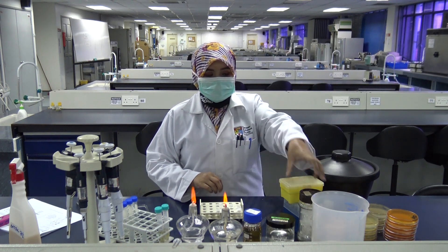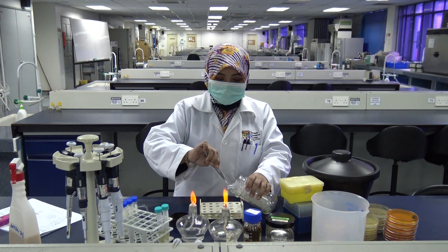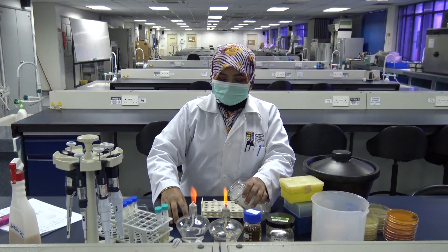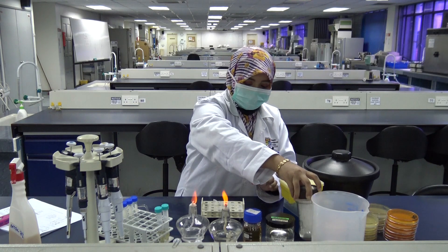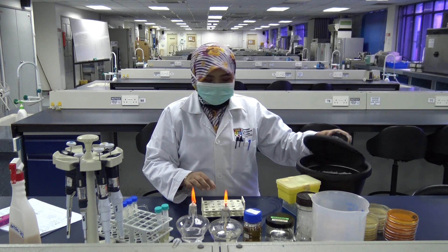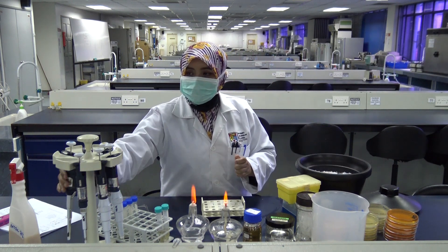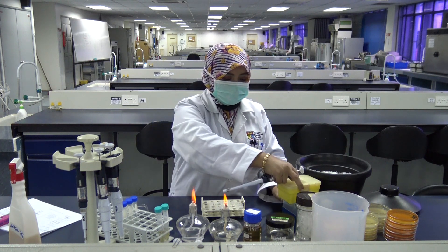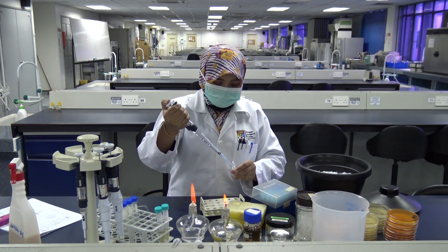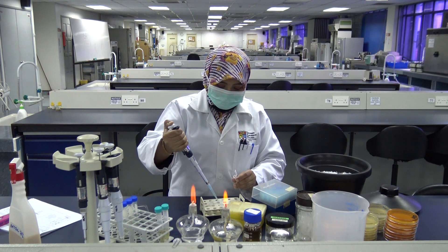In this experiment you are going to mix your donor bacteria cells with your recipient bacteria cells. You do this by taking out an empty, sterile Eppendorf tube. Into the tube you are going to add 400 microliters of your donor cells. Remember to set your micropipet first to 400 microliters and pipet it into your Eppendorf tube.